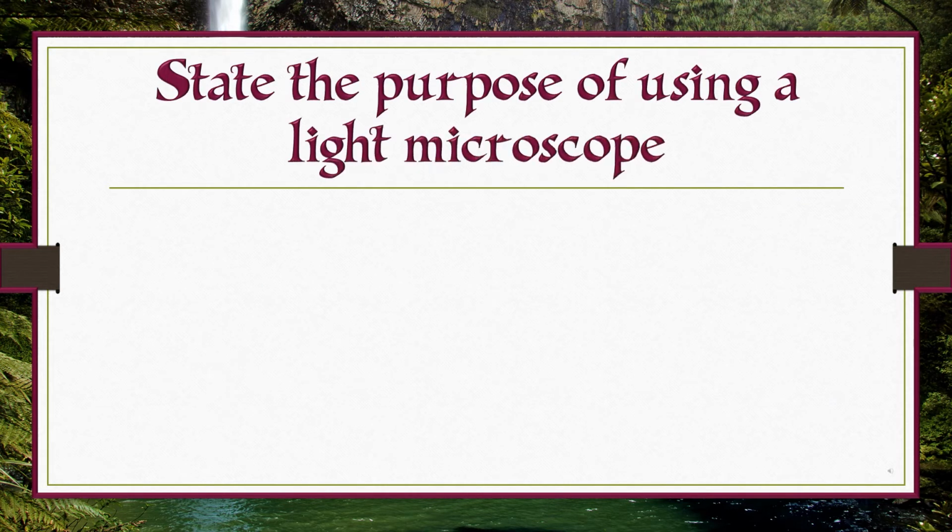State the purpose of using a light microscope.